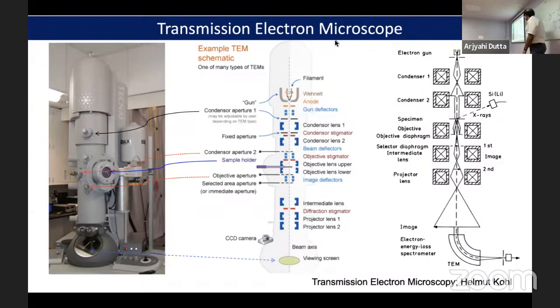Okay, so this is the same microscope where you can see all the details here. Here you can see multiple knobs. The aperture as well as the lens system is connected here. So those are the old setup. That's why you can see all of these things and you can manually control. In most recent microscopes, you will not get this kind of thing at all. Everything is controlled by computer. And yeah, definitely one thing is that when you can do something manually, you have more control.